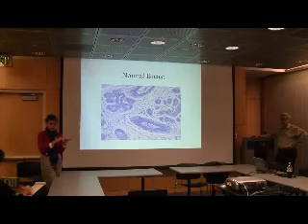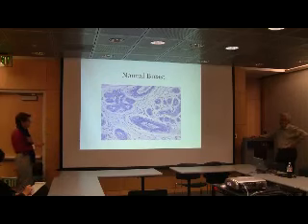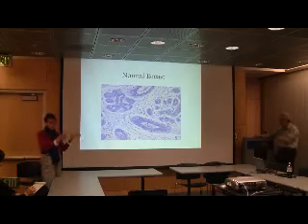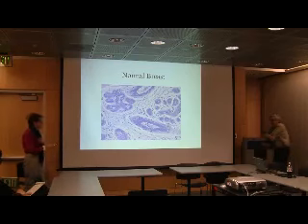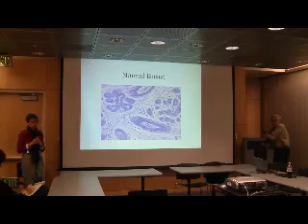Then you put that through a staining process with hematoxylin and eosin, which is pink and purple. So you get purple mostly in the nuclei of the cells, and you get pink in the background. But part of the process when you go through all this handling of the tissue is that you get shrinkage artifacts. Things that used to be together shrink a little bit, so you get gaps like between the duct and the surrounding stromal tissue.